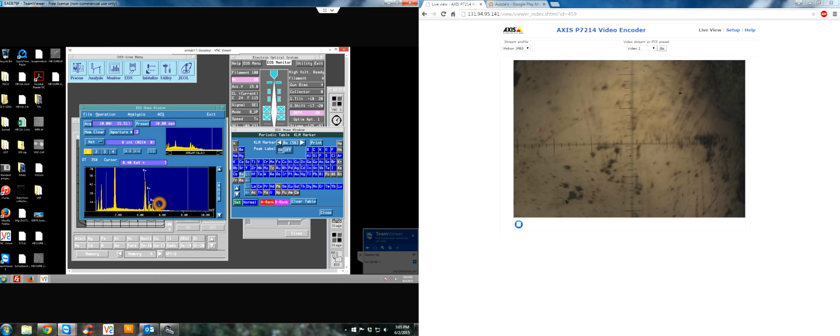Now there's kind of an issue with barium, titanium. They do have a lot of peak overlap. If you see, those are the titanium peaks and those are the barium peaks. So those first two barium and titanium peaks are very close together, and that could be a problem if we're quantifying using the EDS, but we're not. We're just identifying this mineral. And also the lower energy peaks like carbon, that's there obviously because we carbon coated the standard, and then oxygen will be there as well. That's an oxygen peak.